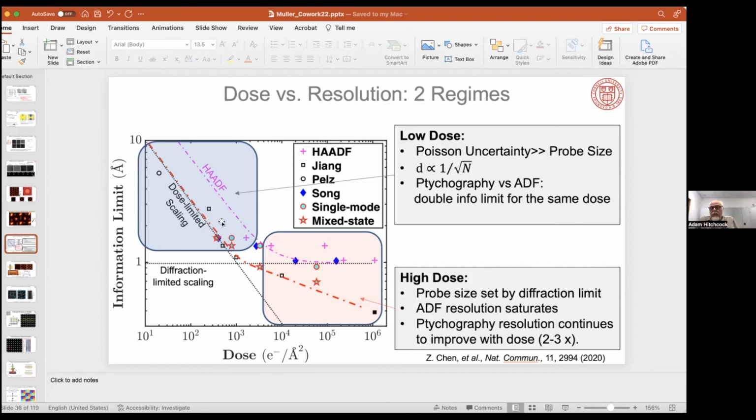But what about things like polymers, or things that are lower spatial resolution? Yeah, even cryo-EM for polymers, or when people are looking at cellular structure, so you're looking at a slice of a cell, that's where I think the ptychography is going to be very useful. And there, obviously, you want to combine it with tomography. That combination, I think, is going to be very powerful. And the out of focus ptychography can cover very large areas very efficiently. So it looks very well suited to these ultrastructure level problems, which are not well addressed by current methods. Thank you.